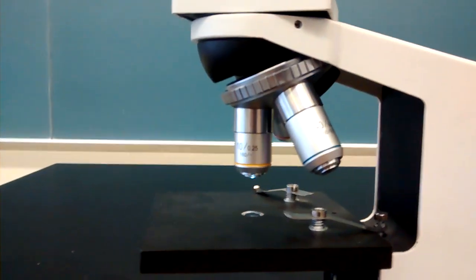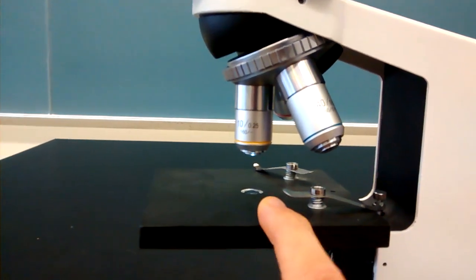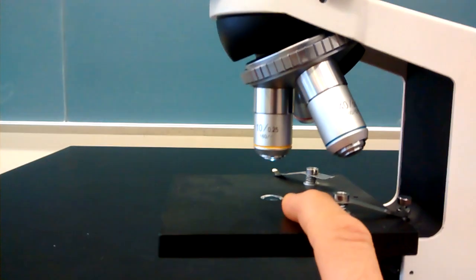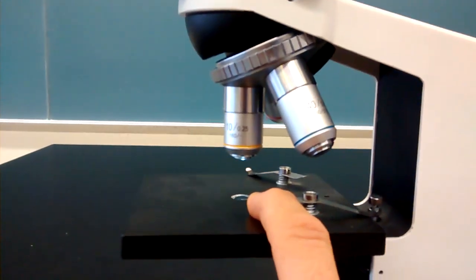Underneath the objective lenses is the stage. The stage is where you place your slide. The portion of the slide that you wish to see has to go over the opening in the stage.